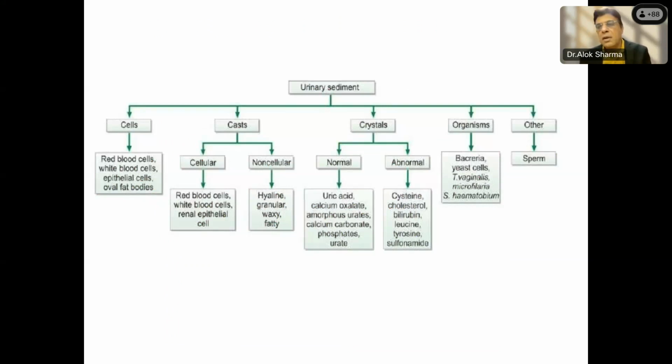because these are not difficult to make, easily available components. Most of the histology and hematology laboratories will have these stains readily available. You don't have to buy anything extra. So you can just prepare a stock solution and quickly do these stains as and when the samples come. So this I have already told you.